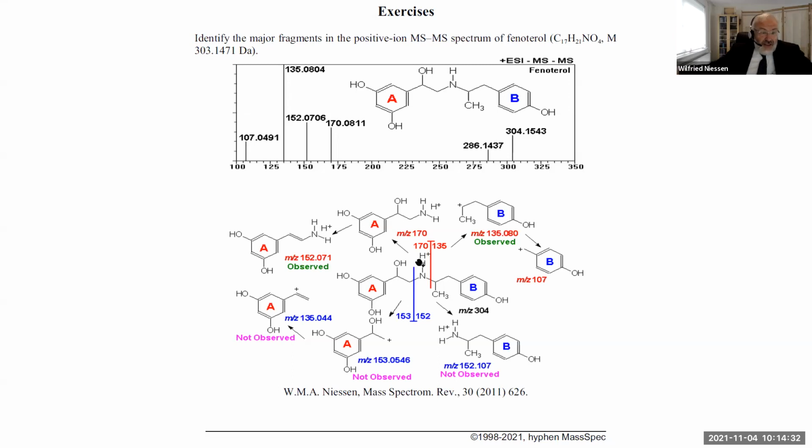And then, of course, it's a matter of dealing with that and doing a structure proposal based on what we have. Yes. So in case you get 1 or 2 candidates, I understand. But let's say you use the elemental composition software and you get 10 candidates for this designated mass accuracy. In that case, do you give up on this fragment and move on to maybe a lower mass fragment, or try to? No, because if you get the 10 candidates, you will not have 10 candidates with elemental compositions which can actually be made from the structure you're looking at.